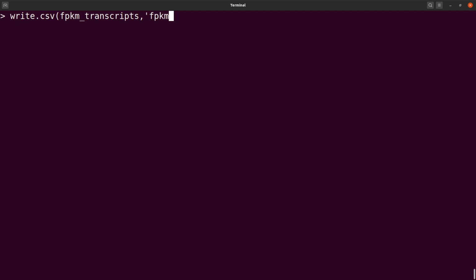So let me say fpkm underscore transcripts. This time, because it's an output file, we need to put it in quotes. So fpkm underscore transcripts.csv. And then I'll say row.names equals true. This time I'm saving everything. So that's how we do it for the transcripts.